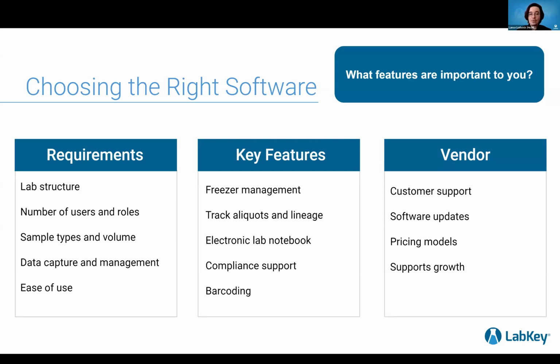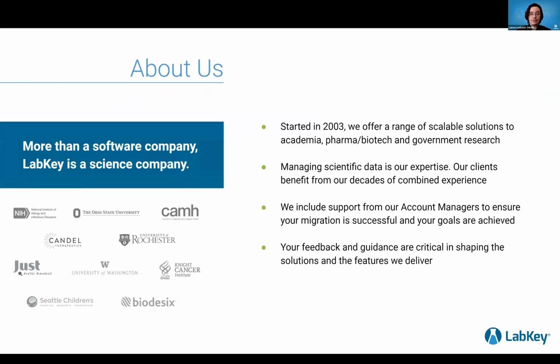We'll dive into who LabKey is as an organization. We're going to give more of a history here. LabKey started over 20 years ago as part of the Fred Hutch Cancer Research Center here in Seattle, Washington of the United States. And we're experts in scientific data management. A lot of us come from science backgrounds, so we're scientists building software for scientists. We've partnered with a wide range of clients from academia to pharma and biotech to government research organizations. So we've worked very closely with a bunch of different fields of sciences and ensured their success.